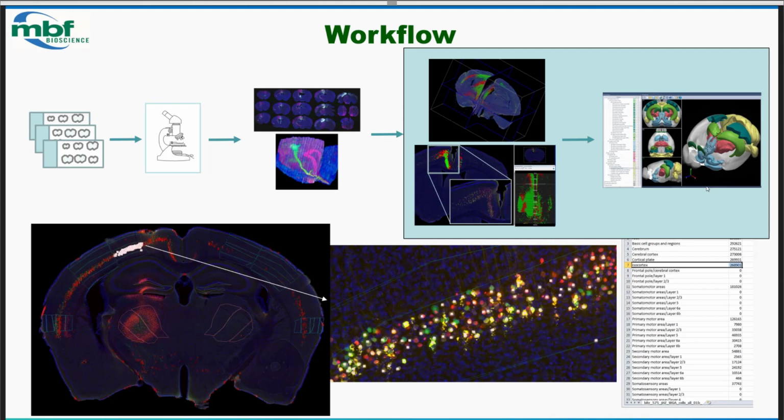In this example, once I've registered my images to the Allen CCF, any measures I make, and here, if you look, their actual cell coordinates in the experimental space, I can apply the transforms that register the images into the Allen CCF to the coordinates of the detected cell markers. And so then I can start to accumulate measures across animals in a common coordinate system. And Chip's going to kick off his part of things with a really cool case study that shows an endpoint and just the power you can have out of this particular technique.